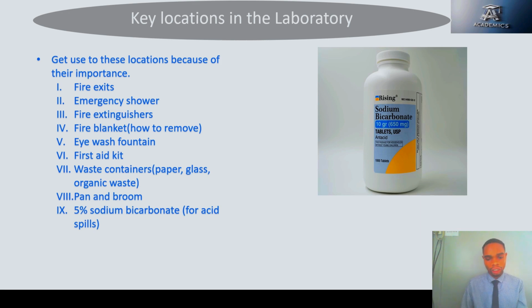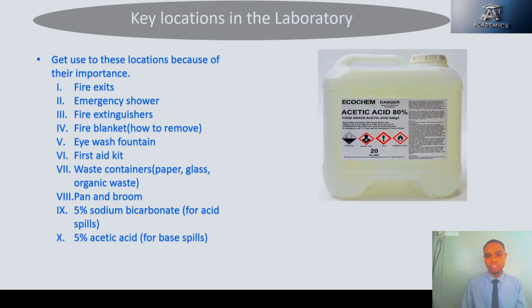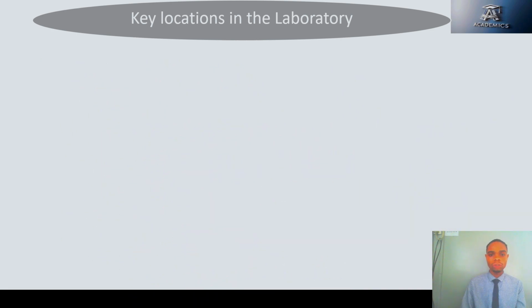Whenever you leave a spill till the next day, it reacts and may lead to a product you don't want to see. So know where your acetic acid is, to neutralize any base spill. So let us quickly go to the rules.